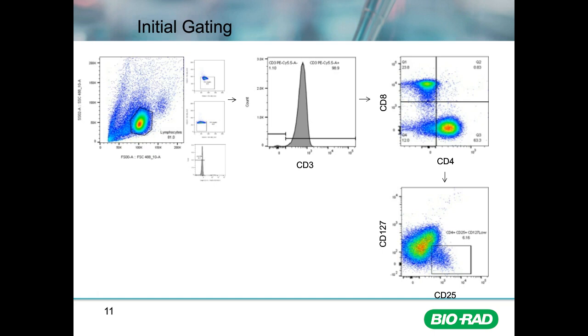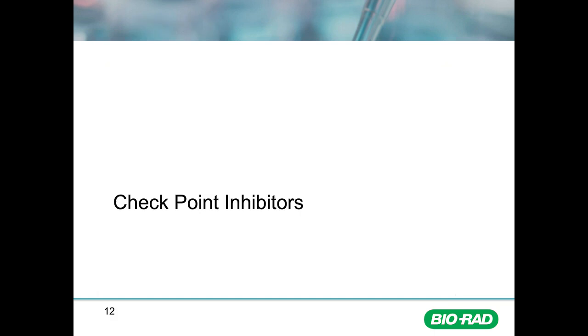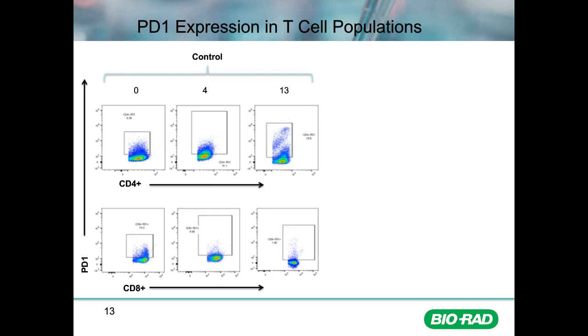During cancer treatment, PD-1 blockade is used to reverse T cell exhaustion and invigorate T cells specific for cancer. In this in vitro model of T cell exhaustion, the expression profile of several checkpoint inhibitors was evaluated on both CD4 and CD8 T cells. First, we analyzed the expression of PD-1 on both CD4 and CD8 T cells in the presence and absence of the PD-1 inhibitor nivolumab. This analysis was repeated for the additional checkpoint inhibitors TIM3, LAG3, and CTLA4.